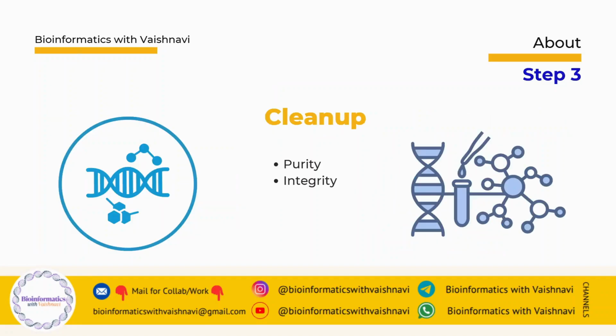Moving forward, the next step is cleanup. After extraction, the sample is cleaned and checked for quality. This ensures no contamination, no degradation, and suitable purity for sequencing. Very pure, cleaned DNA is very important for sequencing.